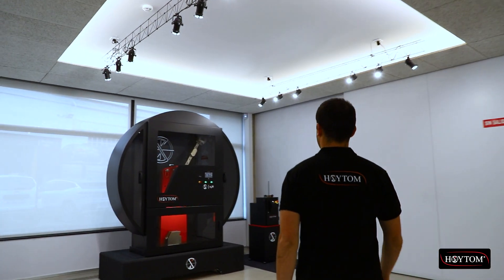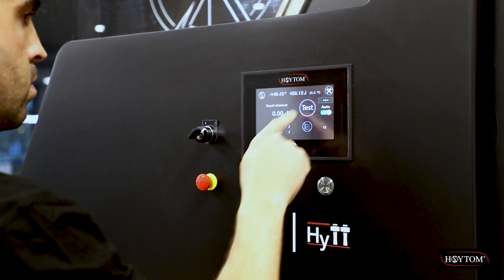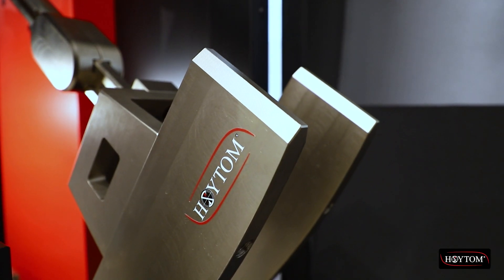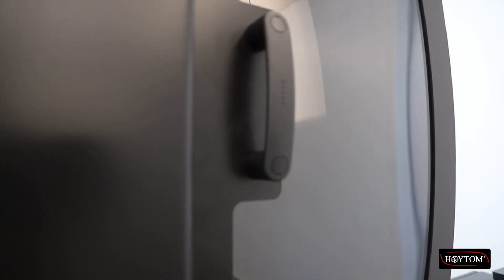Hoytom's HyTT Pendulum Impact Tester enables fast and intuitive testing. The HyTT reduces testing times thanks to its hammer, which automatically returns to the starting point after each test, thus providing greater productivity and user safety.